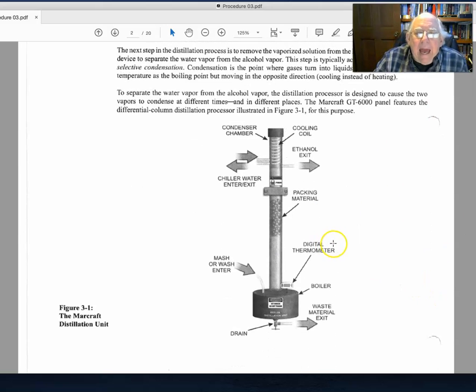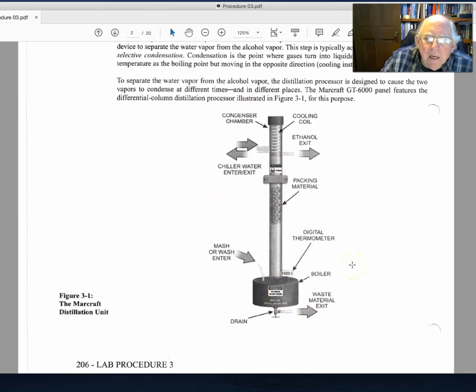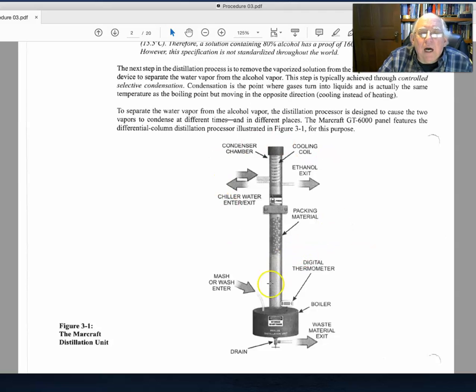The device that we have in the lab consists of a column called the fractional distillation column. The original mash or wash goes into the bottom which is just a boiler controlled by electrical circuitry. As that mash or wash boils, the vapors are allowed to rise through some packing materials—that packing material is typically marbles or a surface for which the fluid will condense and then boil, and continually condense and boil.